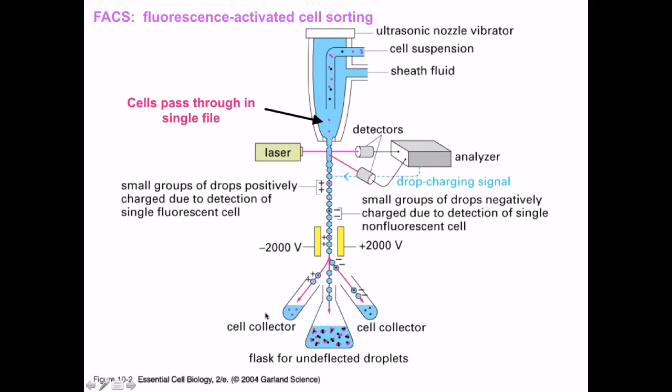So in that regard, the instrument that we have at class is going to allow us to visualize the cell and measure the fluorescence analysis of it. So you're going to be able to just take the sample and see what the cell population is going to be in respect to the DNA.